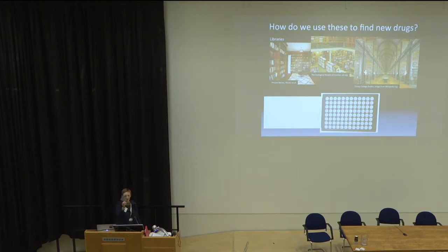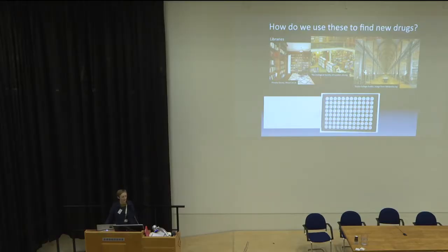This is called a 96-well plate because it has 96 wells, and that means that we can do 96 experiments at the same time. So these all go into our measuring equipment in one set, and it really helps us to maximize the number of experiments that we can do. And there are ones where you can do even more experiments in parallel as well.